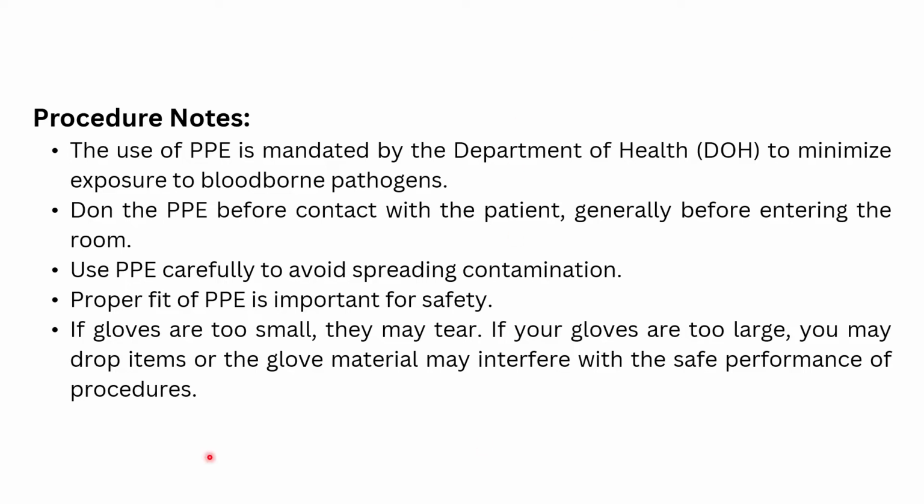Additional notes, the use of personal protective equipment is mandatory and mandated by the Department of Health to minimize exposure not just to bloodborne pathogens, but all the infectious pathogens that are available. You have to don the PPE before contact with any patient, generally before entering the patient's room. Also, use PPE carefully to avoid spreading contamination.